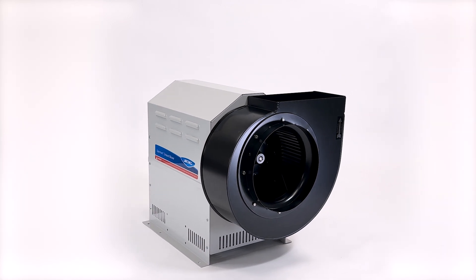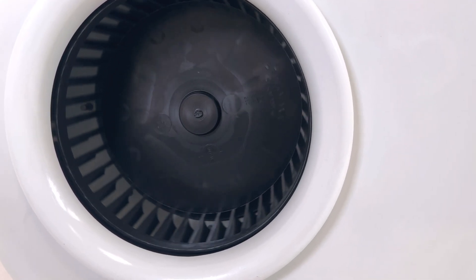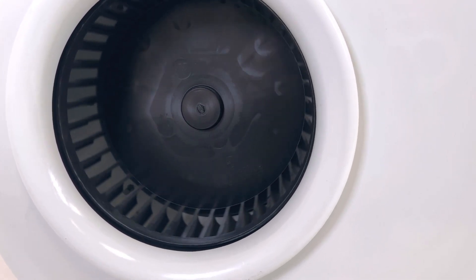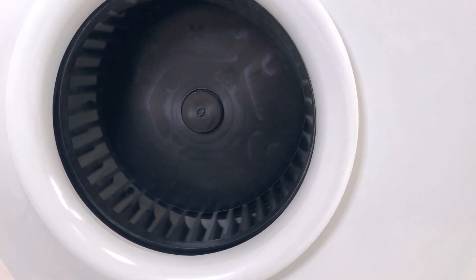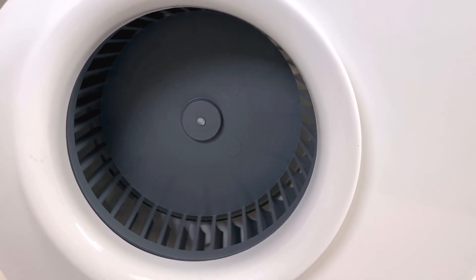A coated steel model is available for less corrosive applications. Fiberglass and PVC models feature non-sparking materials of construction throughout the airstream, making them perfect options for applications that serve electrically classified spaces.